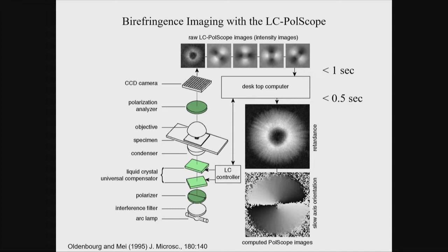So this object, this array of microtubules, now if you turn this to circular polarized light that has the opposite handedness to the one that is filtered by the analyzer, then the background looks dark, and any part of the field that has some birefringence will show up to some degree, and then you go quickly through some elliptical steps and you see the symmetry is changing, even though the object is not moved in any way. And it's in a very short succession.